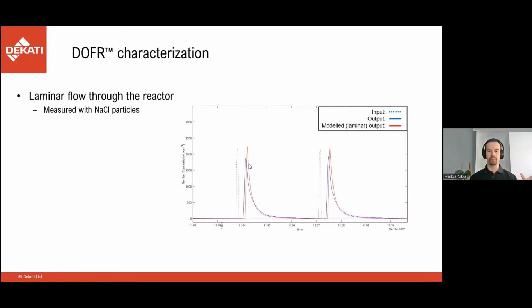The difference between the modeled and the measured output is very small, indicating that the flow through the reactor is laminar.